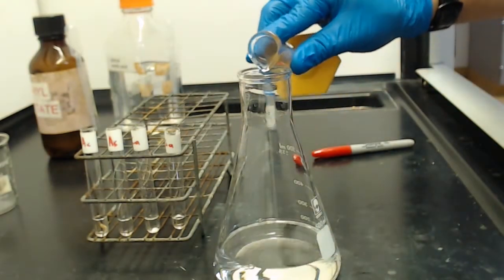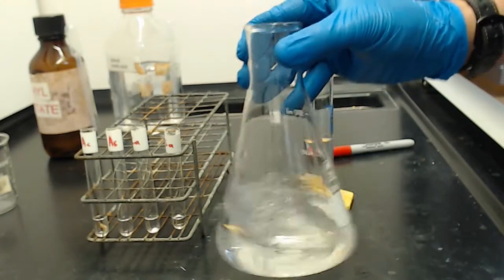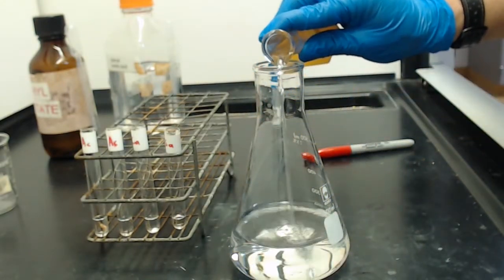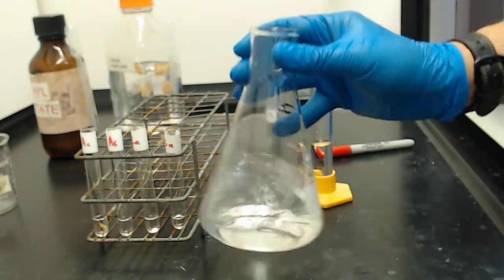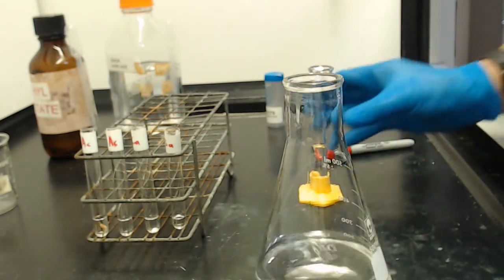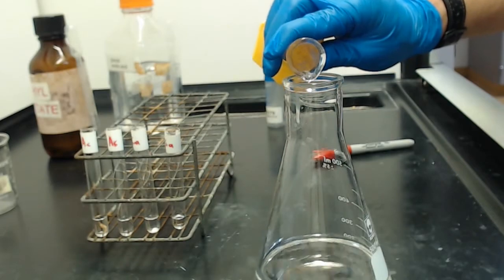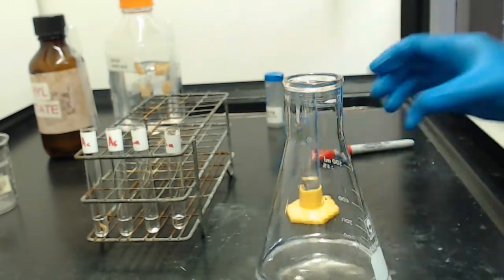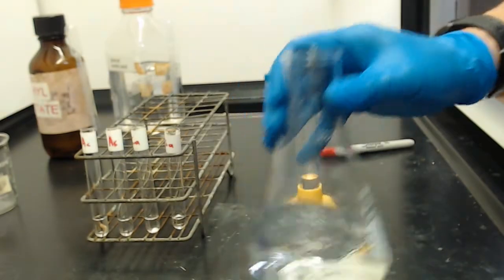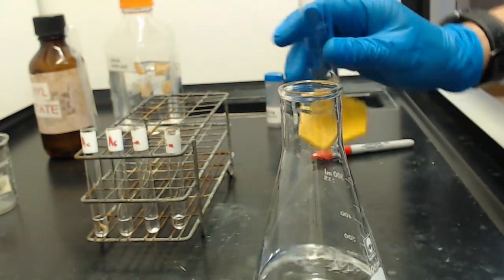And remember, anytime you're mixing strong acids, you definitely want to take it slow. Don't mix it all at once. Be careful. You should always wear gloves for this. If you're doing this in person, you'll notice a really strong vinegar odor. So this is basically concentrated vinegar that we're working with today. Don't add it all at once. I like to take it slow. It's not getting overly hot today, so I'm going to just add the rest of it in here.